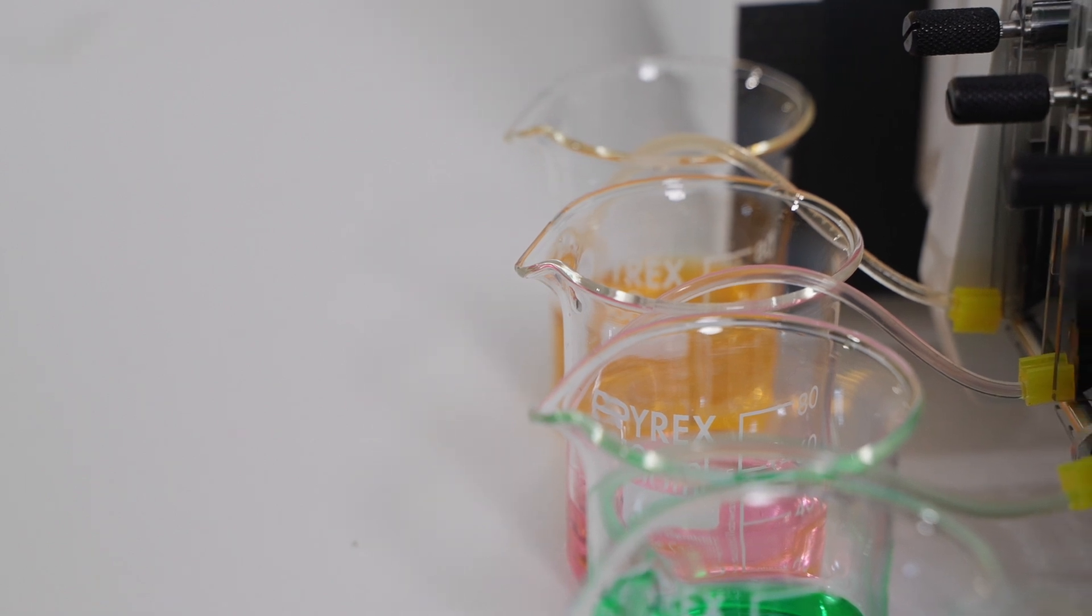We see our multi-channel pump heads used in a variety of instances, whether that be to dispense many different fluids at once or trying to reach a level of precision that only smaller tubes can hit.